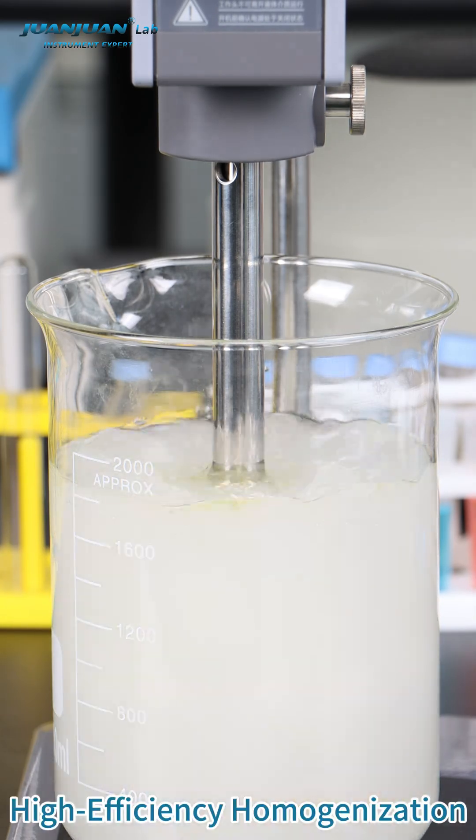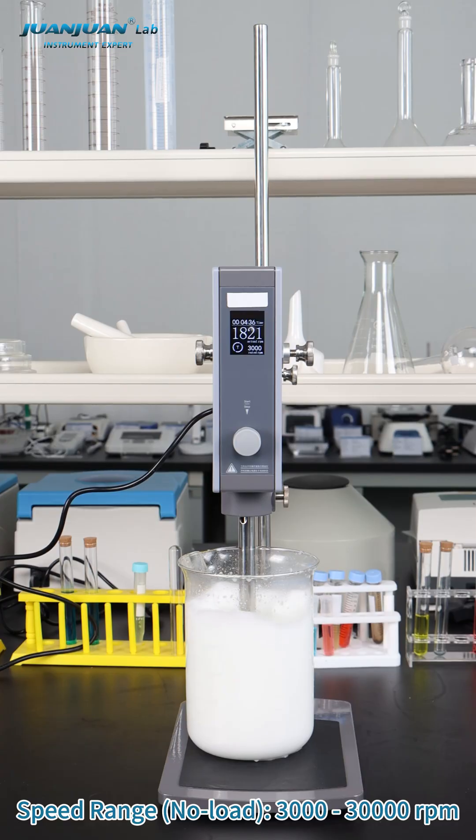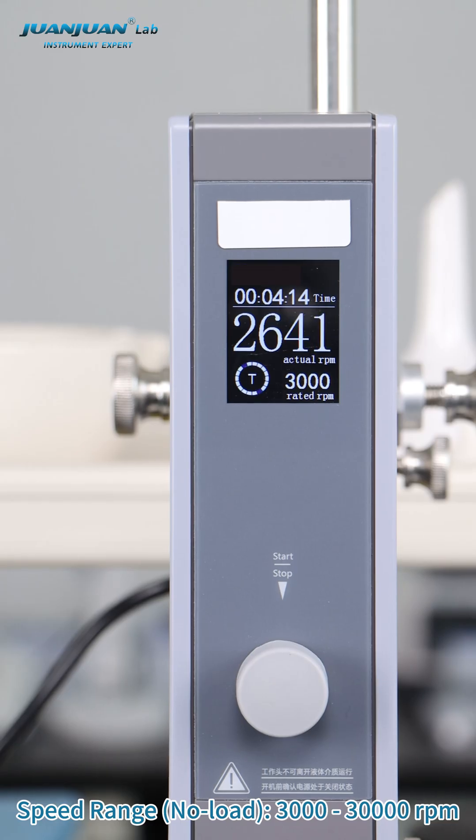High efficiency homogenization. Speed range no load: 3,000 to 30,000 RPM.